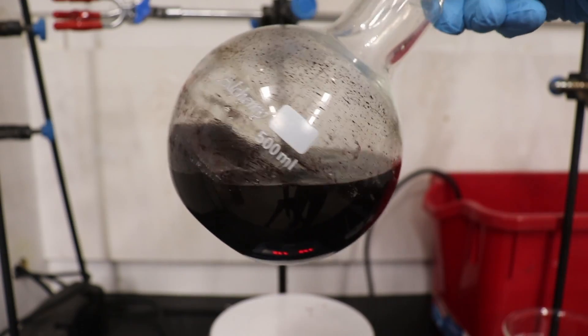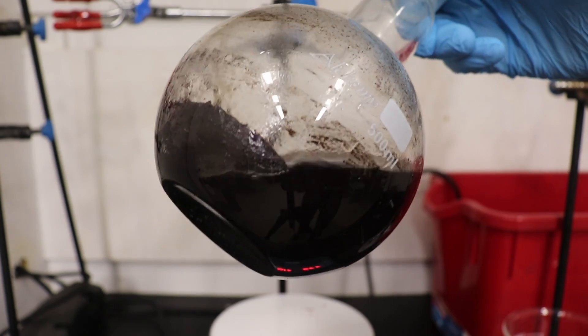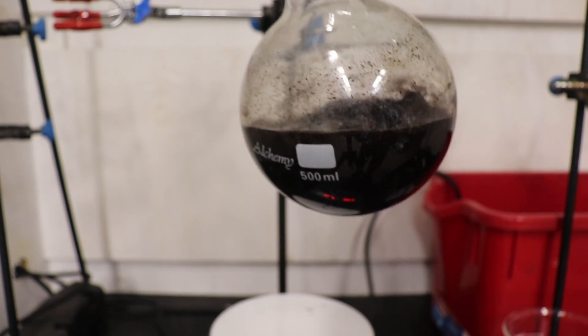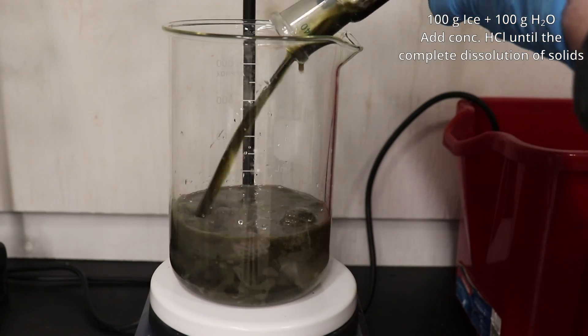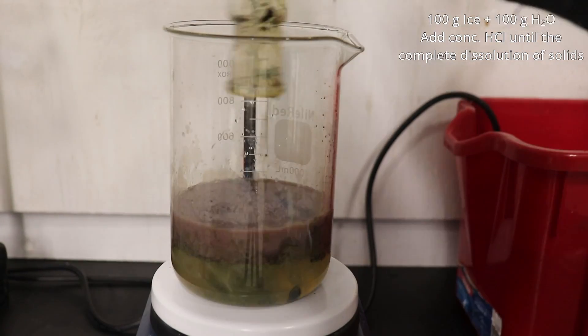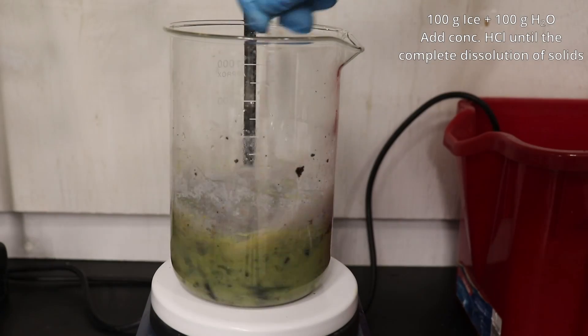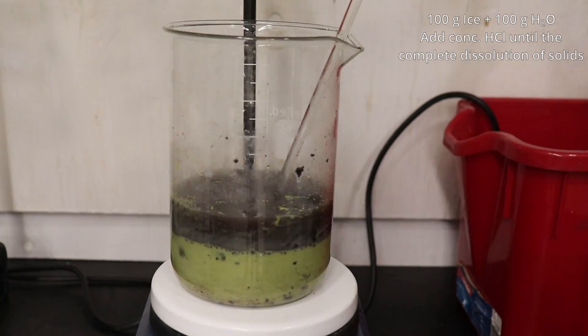The solid mass at the bottom of the flask was broken up with a spatula and by stoppering and shaking the flask. The reaction was quenched in a mixture of 100 grams of ice and 100 grams of water. Then concentrated hydrochloric acid was added until the solids were completely dissolved.